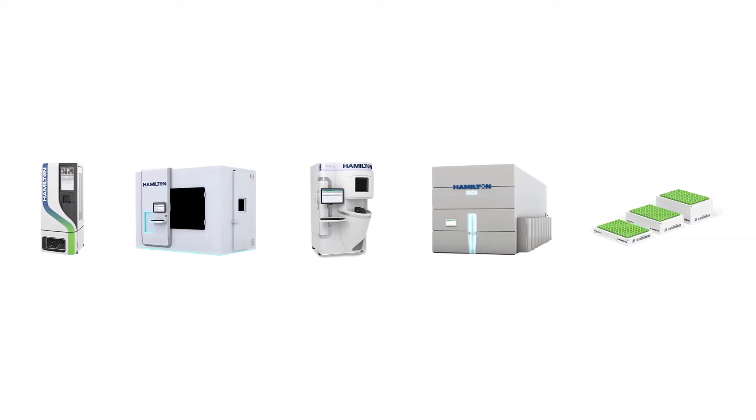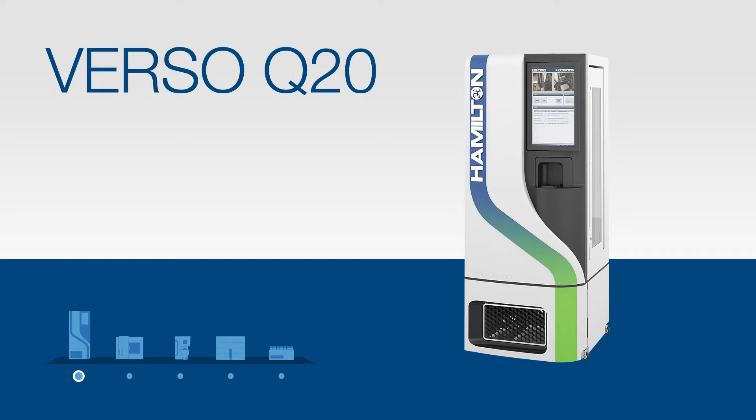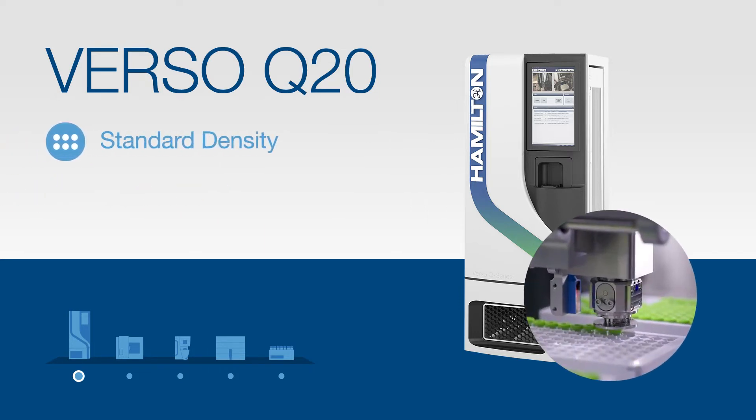In addition to our LabElite line of benchtop devices, Hamilton Storage offers ultra-low temperature automated sample management systems. We start with Verso Q20, a compact automated sample management system for sample storage at temperatures ranging from ambient to negative 20 degrees Celsius. The Q20 offers a sample capacity of 15,000 to 36,000 depending on types of labware being stored. This compact system was designed with convenience in mind, perfectly sized for even the smallest labs.